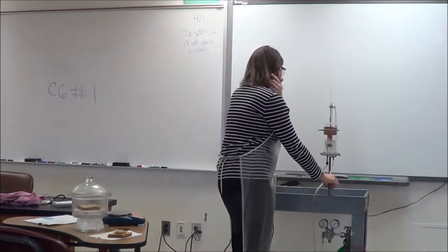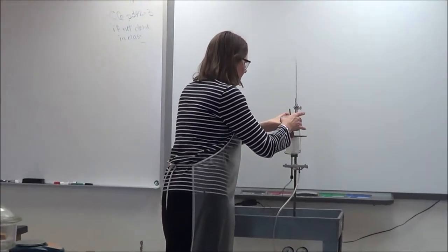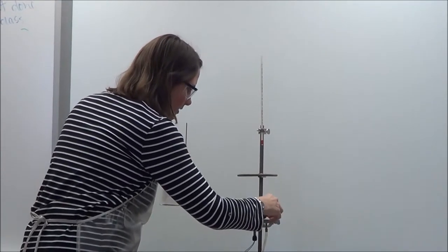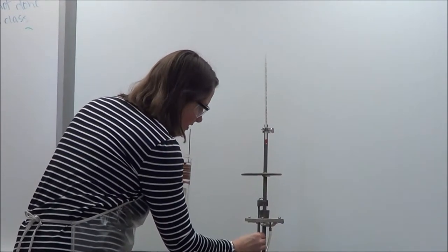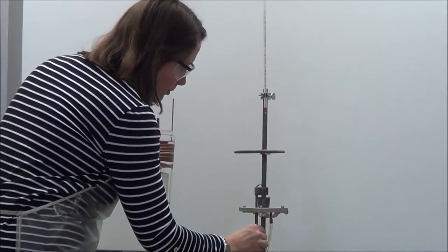So at this point, I will put the bread in the crucible in their spot. I'm going to line up this little metal coil so it's touching the bread. When it gets red hot, it will ignite the bread.